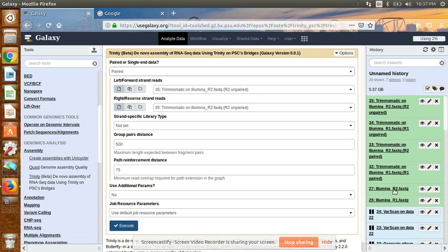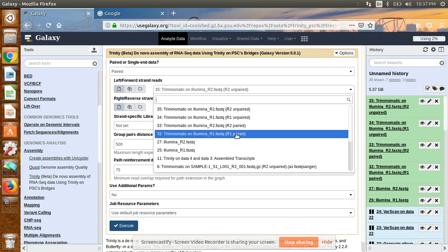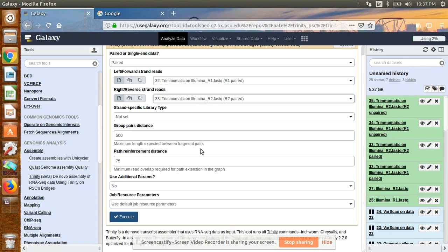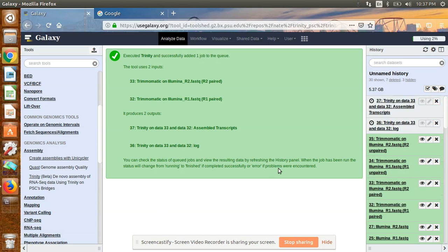In the last video I showed how to trim your data — this is the forward and this is the reverse data we got from Illumina sequencing, which we trimmed using Trimmomatic software. If you don't know how to trim using Trimmomatic, you can go to my previous video. After getting the trimmed data, we can use it for de novo assembly. Select R1 paired and R2 paired sequences — both forward and reverse — and then click Execute to start the assembly.